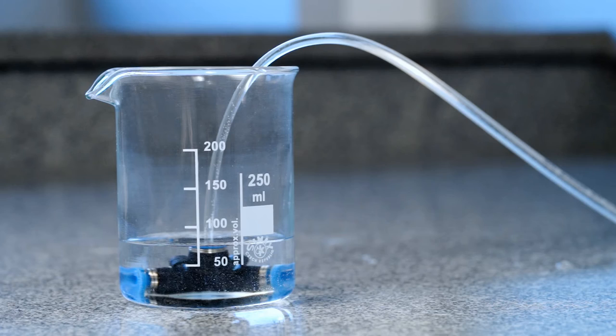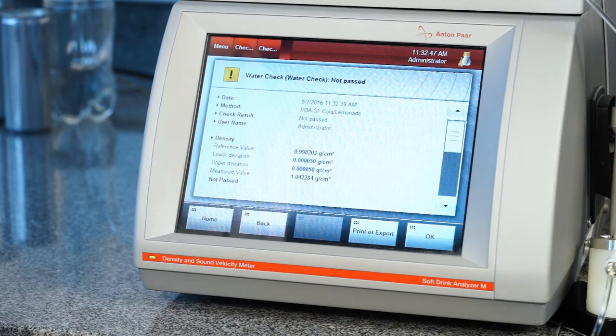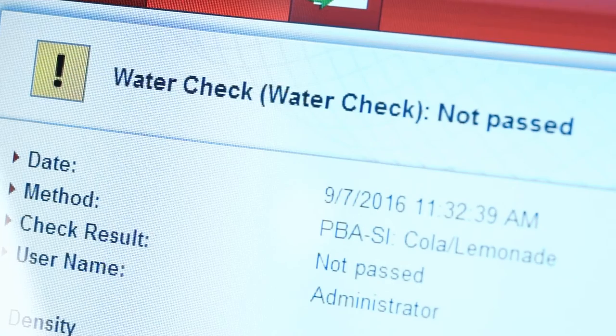If the pressure is too low, the sample volume is not enough for your configuration, or the water check should fail, please refer to the instruction manual.